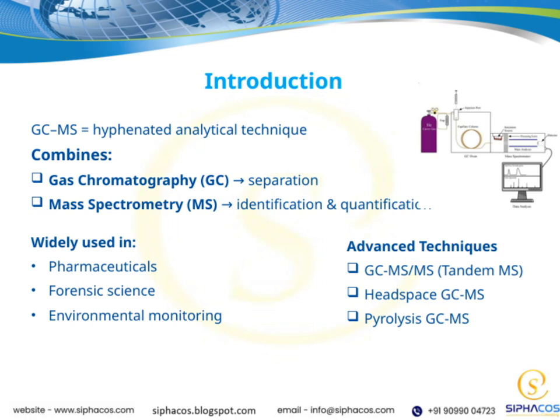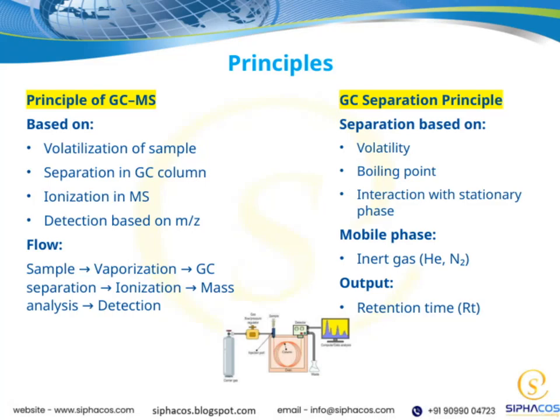Overall, these advanced techniques build on the core capabilities of GC-MS, enhancing our ability to analyze complex samples with greater sensitivity and specificity. Let's take a closer look at the GC separation principle.